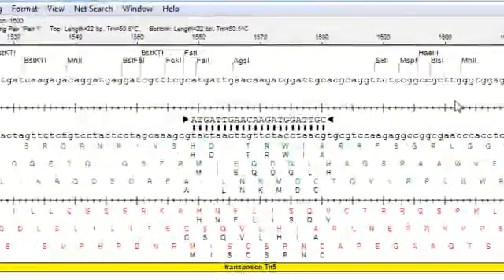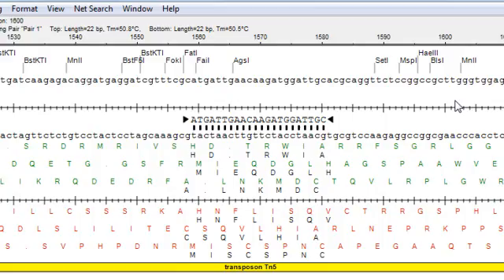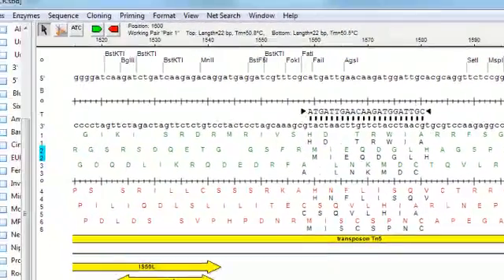After creating a primer pair for your region of interest, you may want to edit one of your primers, and there are several ways to do this.